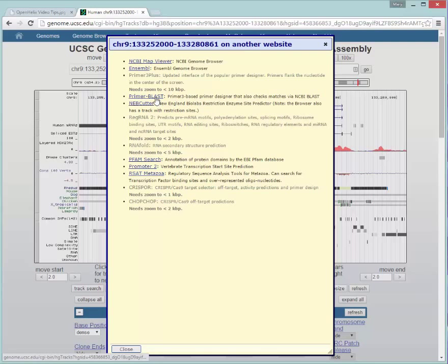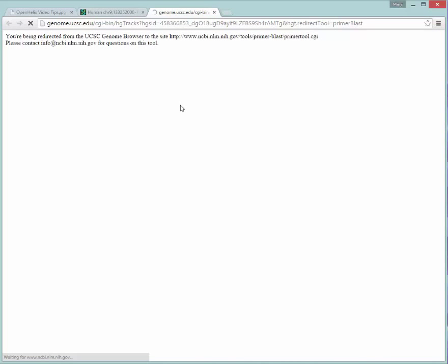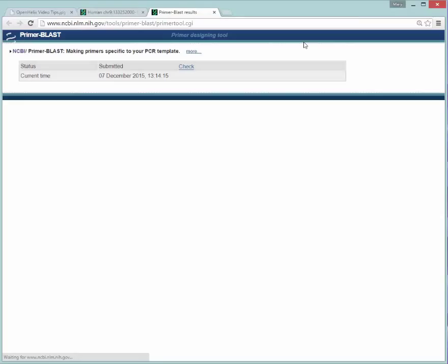First, I'll click this Primer Blast. And what this is doing is it's taking that sequence that was in our window and it's now sending it over to NCBI to use the Primer Blast tool to obtain potential primers that might be useful for us. So you'll see that it will load over here and it will take a little while to get into the queue.